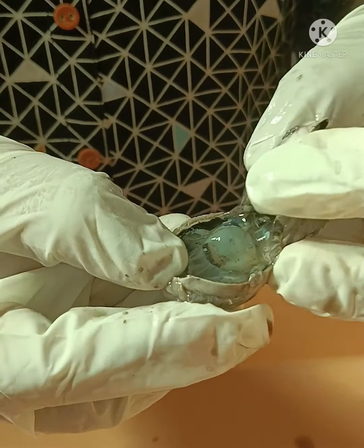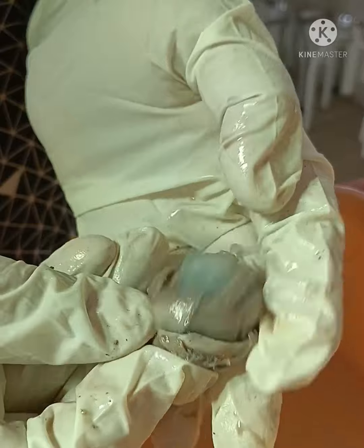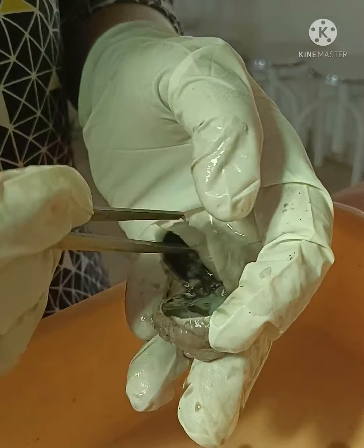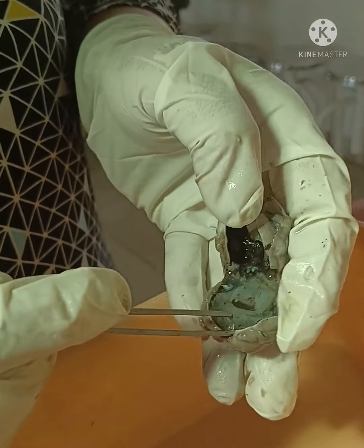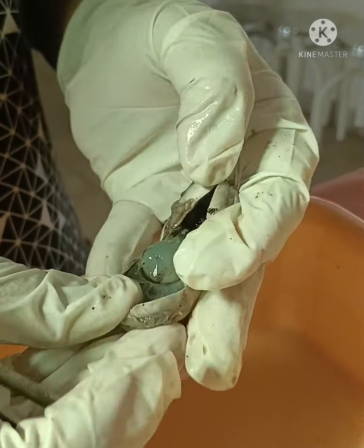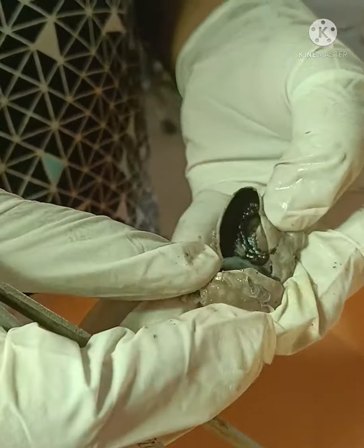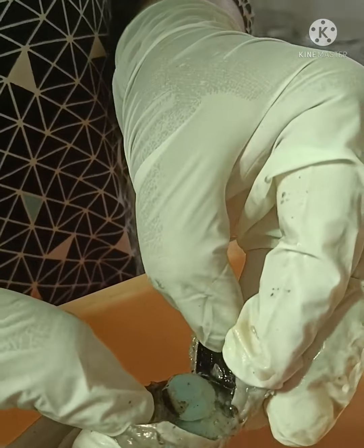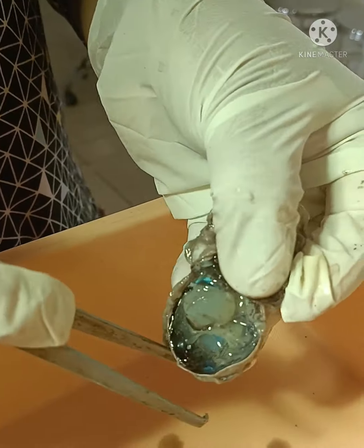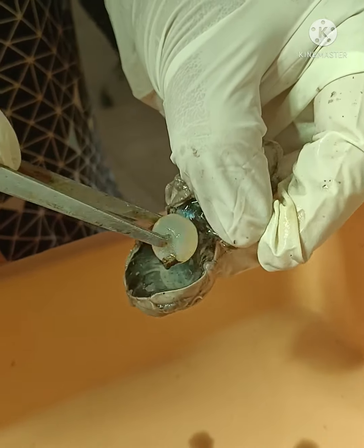To see the internal layers, once we open the eyeball, it appears like this. The middle layer we call the uveal tract or vascular layer. These are the layers from external to internal: the iris, ciliary body, and choroid. Here is the posterior chamber of the eyeball, where we can see the lens.